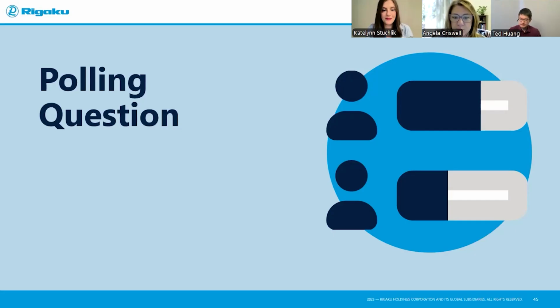So the question is, which 4D studies are you most interested in? I'll just read these out because if you're watching the recording, you can't see this poll. Are you interested in ex situ mechanical or maybe in situ mechanical? Are you interested in ex situ temperature control? Maybe you're interested in in situ temperature control, or maybe you're interested in something completely different ex situ, or maybe even something other that's in situ.